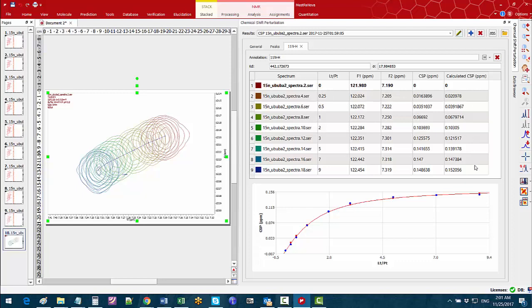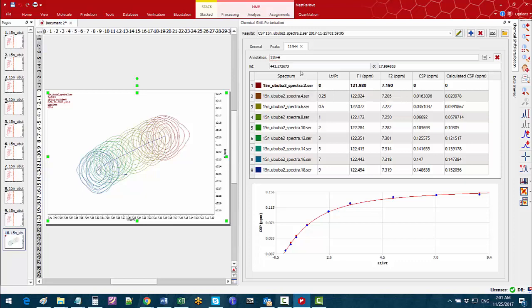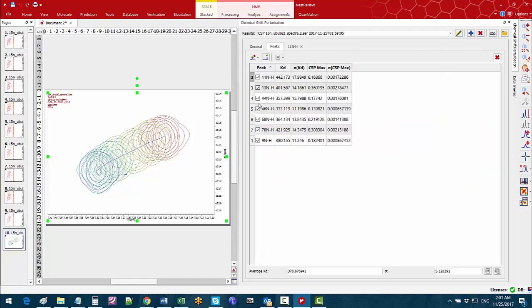Above this we can see the annotation or label of each peak, computed KD and the error of fitting. Then you can click to see the details for other peaks and so on.